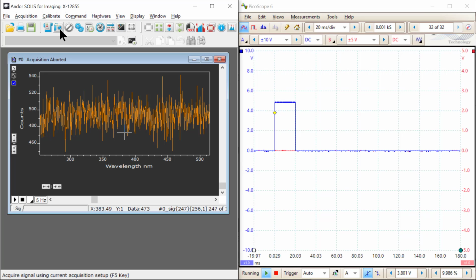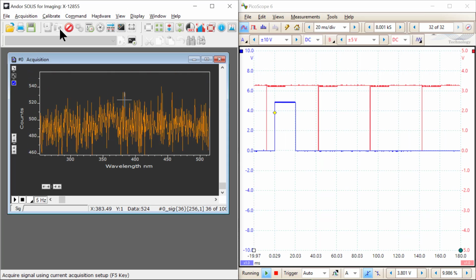And maybe what I'll do is I'll disconnect the power from my trigger generator, and I'll say, OK, let's wait. Now this camera will wait, ready to pounce on the first frame, or the first trigger that comes to it. So I'm going to plug my function generator back in, or start it up again. And in a second, it should get a trigger. And I'll see a little LED start. Oh, and now it's collecting frames.